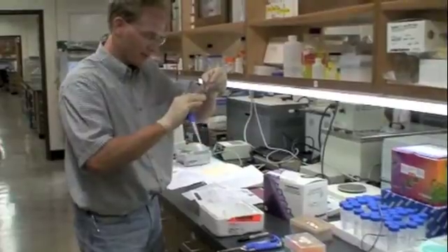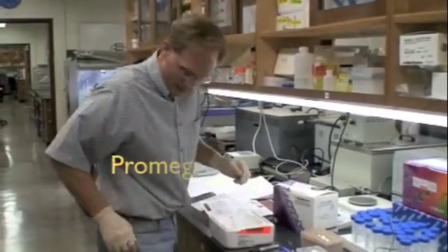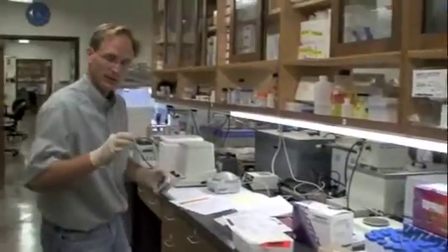It says to flick them gently — don't vortex — because the cells are very fragile. We're supposed to leave them on ice for 30 minutes. I'll start the timer, but I'm also going to return the remaining stock right away to the minus 80.